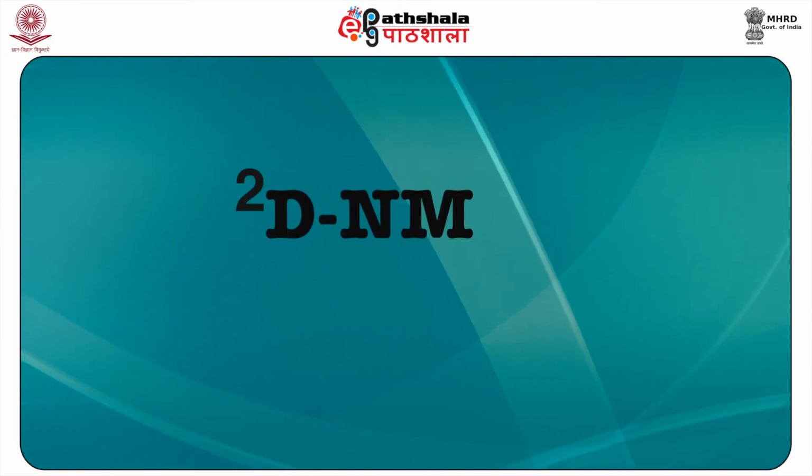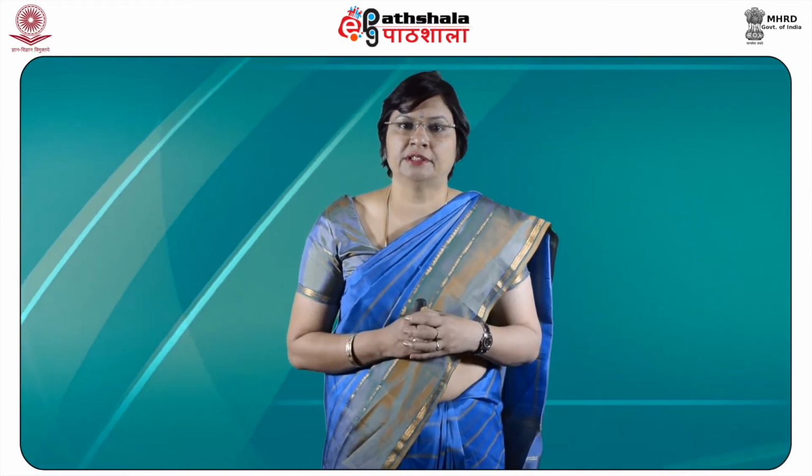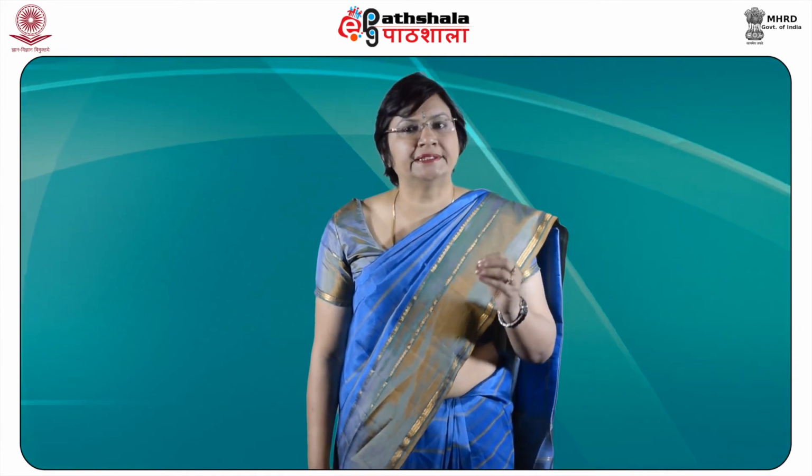Now, let us go to 2D NMR. A conventional NMR spectrum is a 1D NMR spectrum that we have already studied, and this, if we recall, is a plot of intensity against frequency.